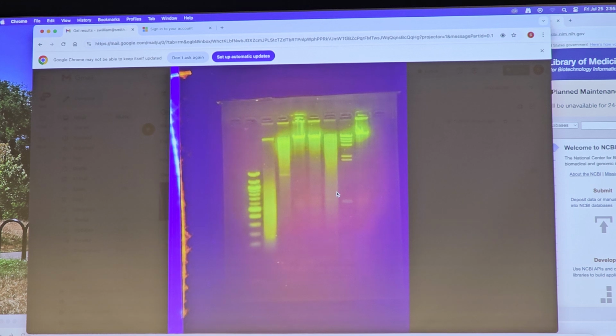Can you quantify the methylation, or just say that? No, this would just say, yeah, there's a lot of methylation. If you want to quantify the methylation, then you've got to do something a lot more complicated. And if you want to know methylation of specific genes, again, this PacBio system is probably the best way to do it.